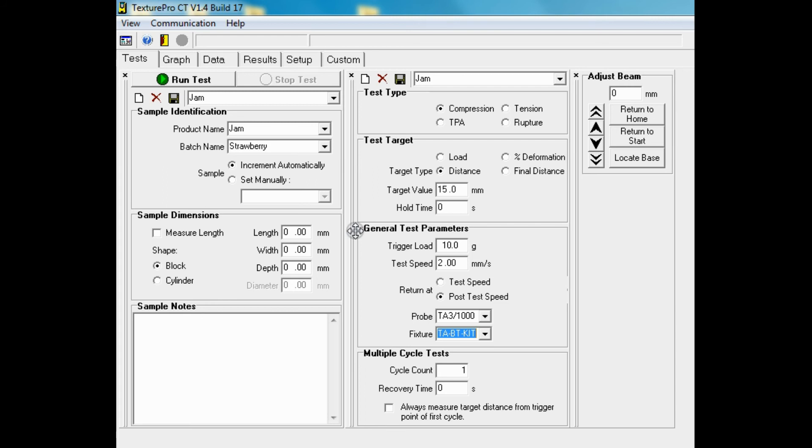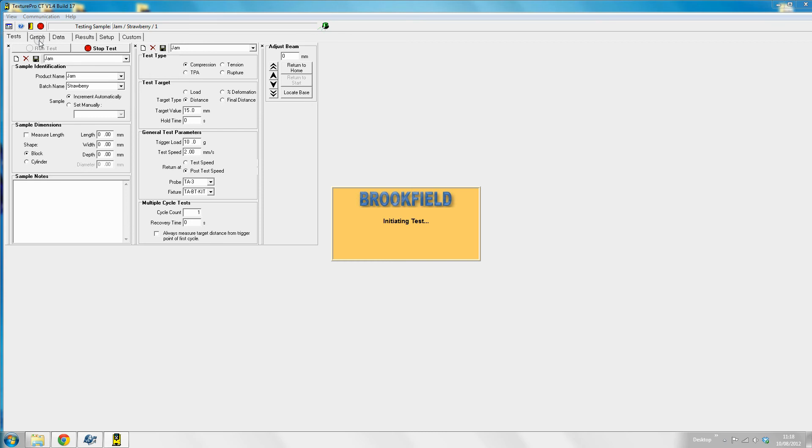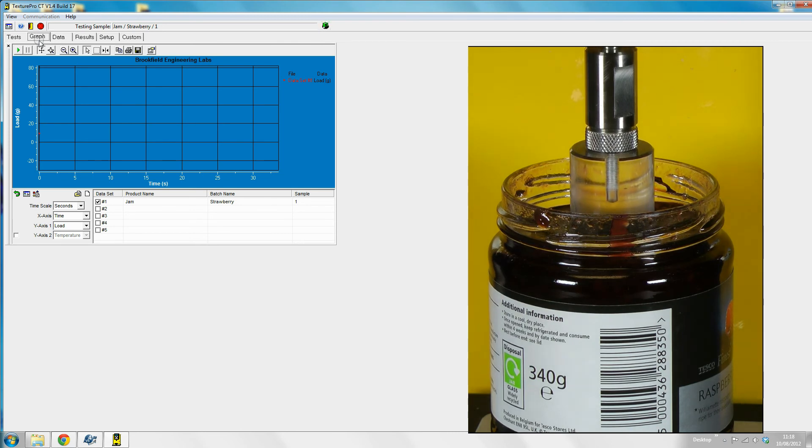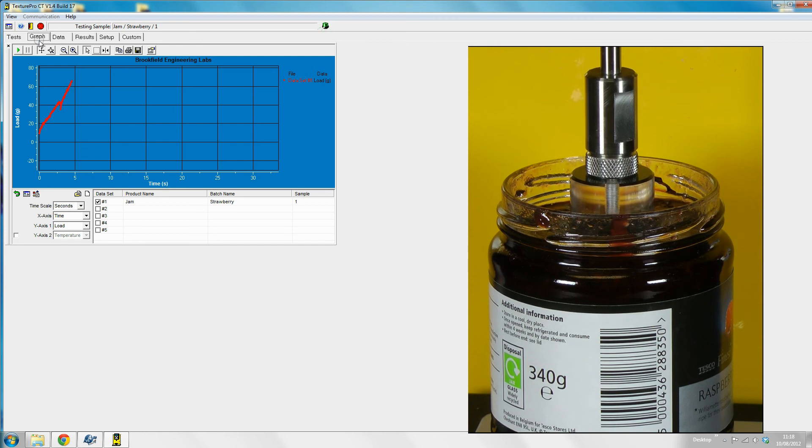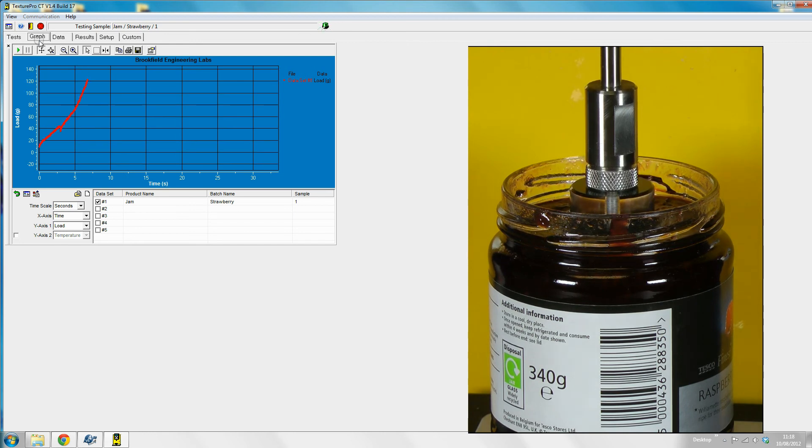We can now press the start button and start the test. On the left you can see the test recordings and on the right the CT3 texture analyzer performing the test.